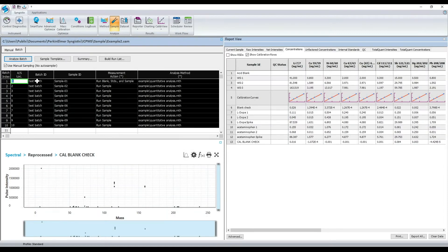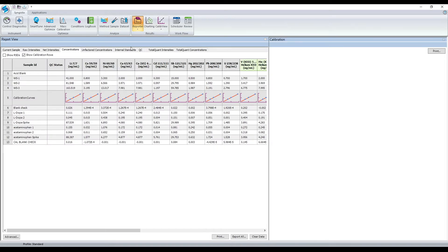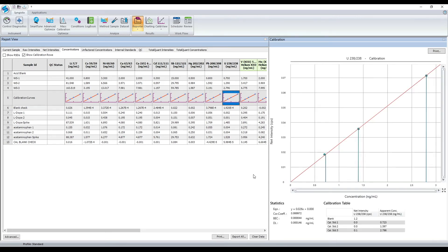Now that our analysis is complete, we can examine the data. This is the reporter screen, which summarizes the analytical data. As you can see, there is a snapshot of the calibration. To get more details, you can click on the small calibration plot to open the full calibration window.